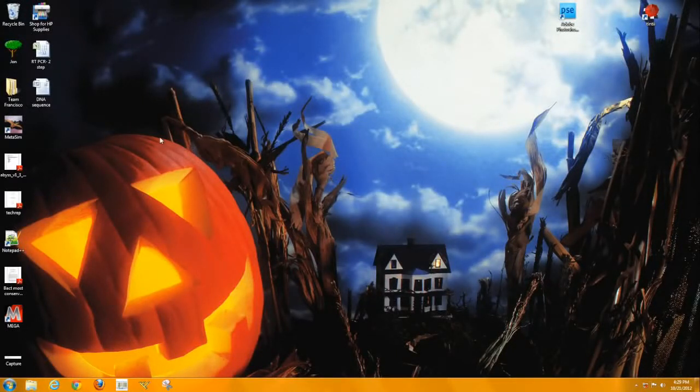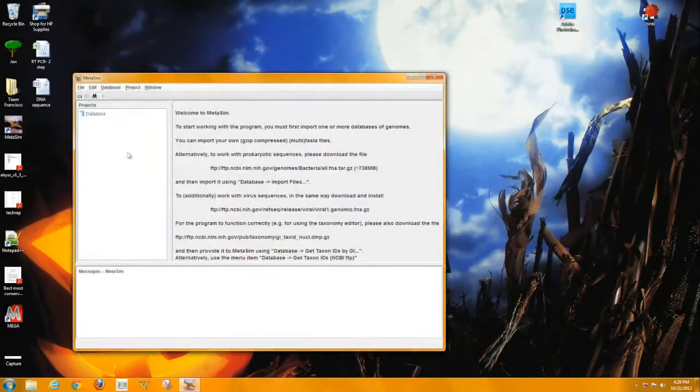And this video is going to be the first video in a 6-part series which covers the various bioinformatic tools used in the eDNA project.